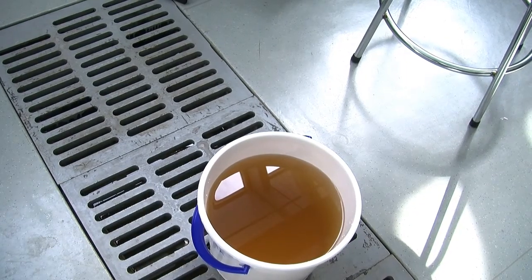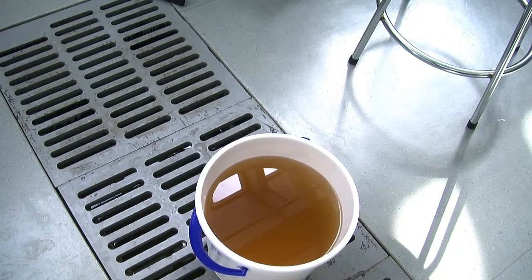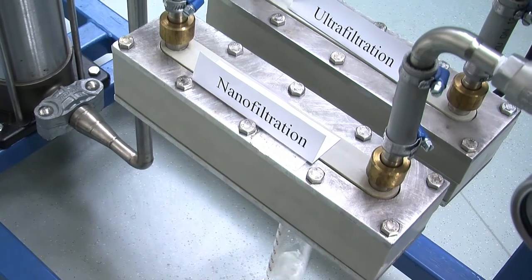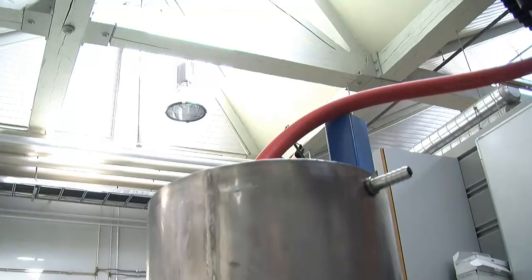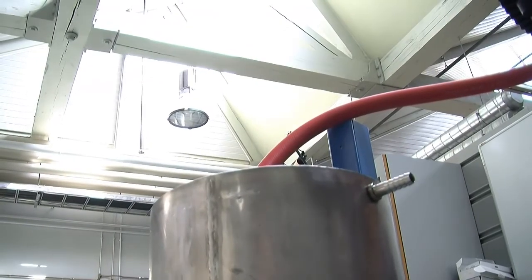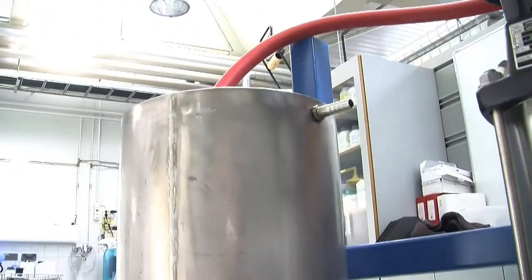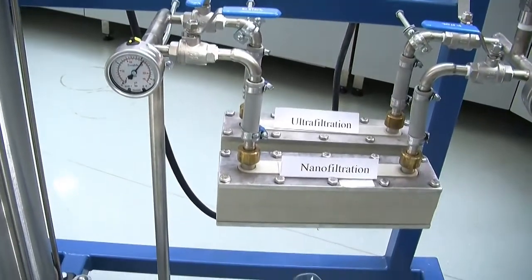In this demonstration, humic substances are removed from the raw water. We have a nanofiltration membrane in the front cell and an ultrafiltration membrane in the back cell. The humic containing brownish raw water is pumped from the feed tank through the membrane module and the flow meter and circulated back to the feed tank.